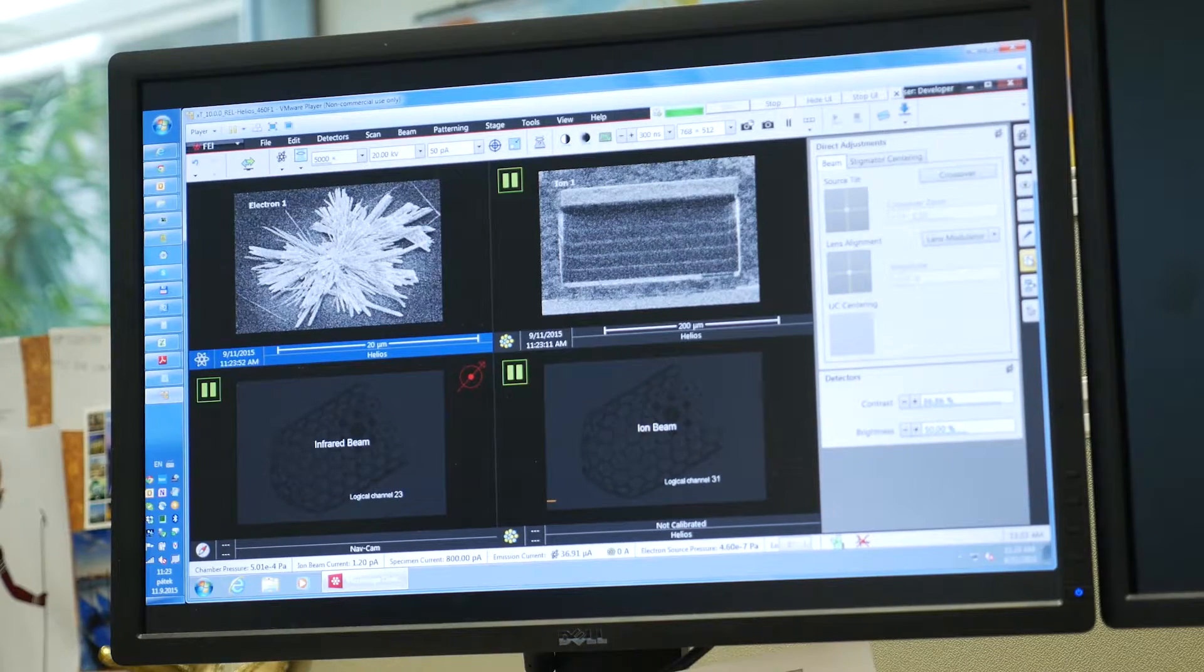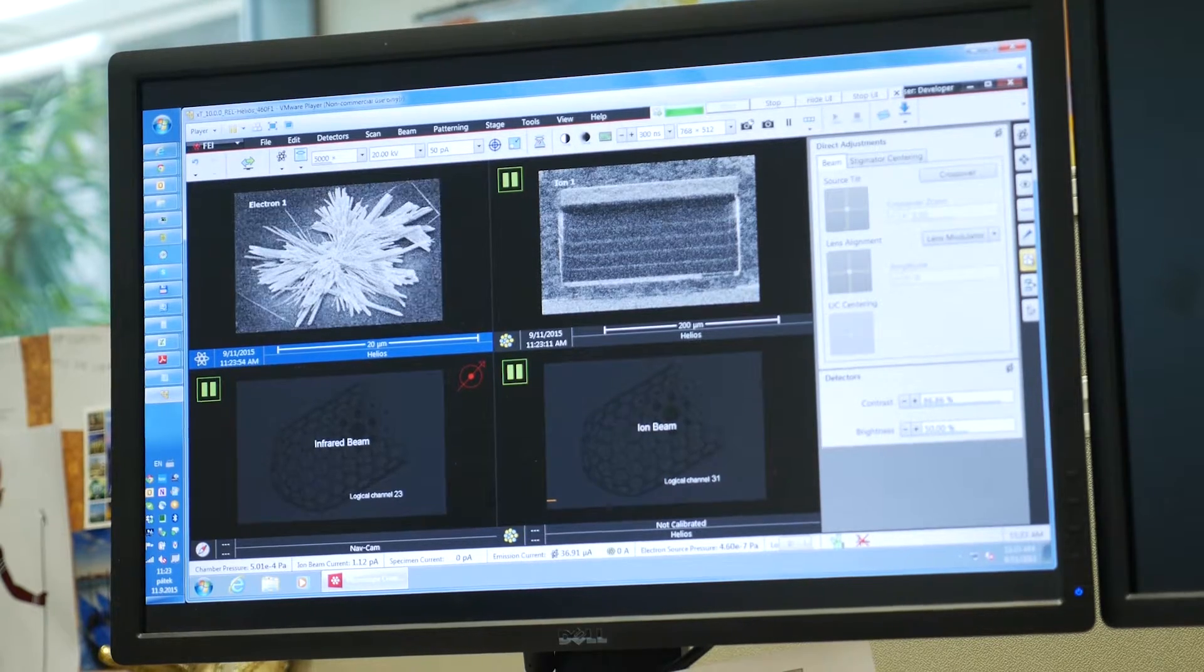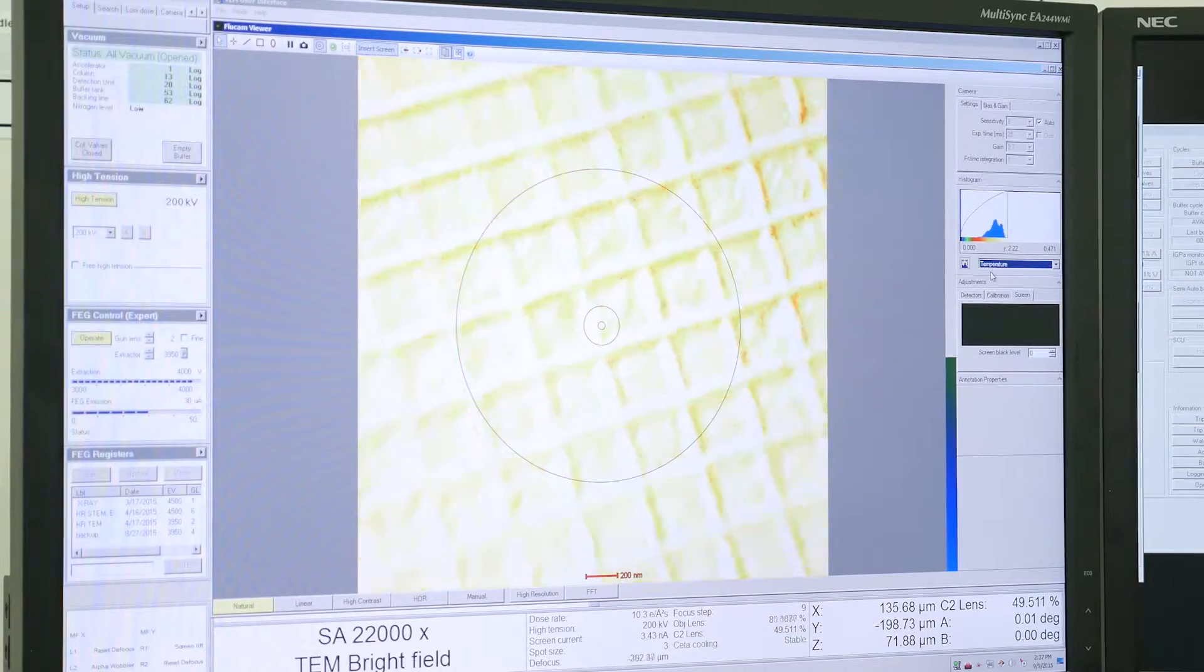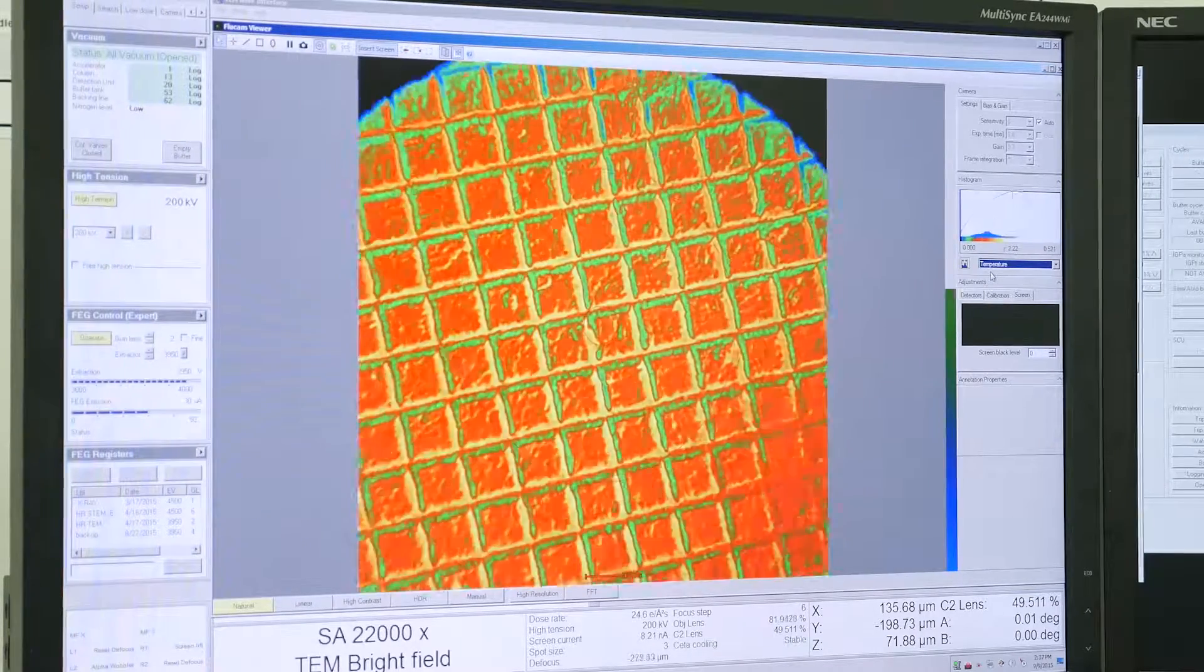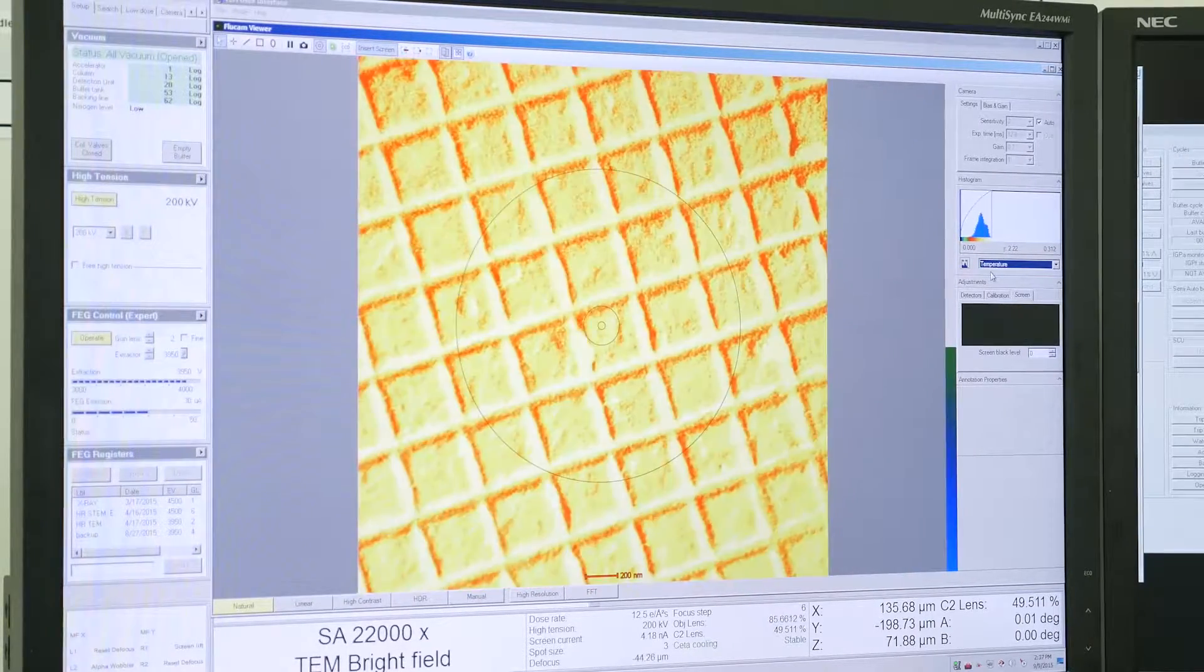The image obtained with the detectors in the microscope chamber is projected on the screen. So is it possible to watch the sample in different ways, depending on the microscope setup? Yes, and it is the software which makes it possible to find the optimal conditions for a particular purpose.